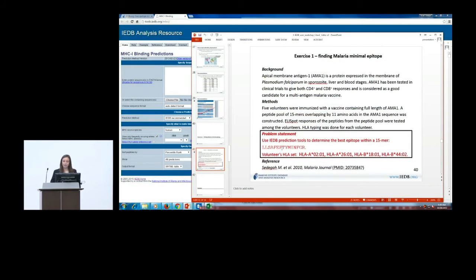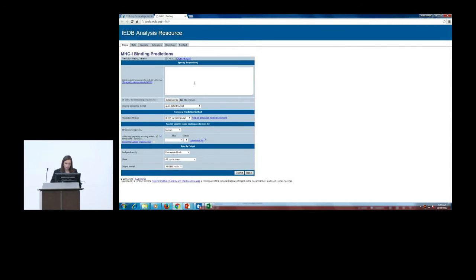So basically, in terms of your protein sequence, you only have a 15-mer peptide, so it's not a large sequence. We only want to test this peptide for potential epitopes within it. So if we go to the tool, for our protein sequence we just paste this peptide here. For the method, you don't even need to think: you just use IEDB recommended. We have human as the species.